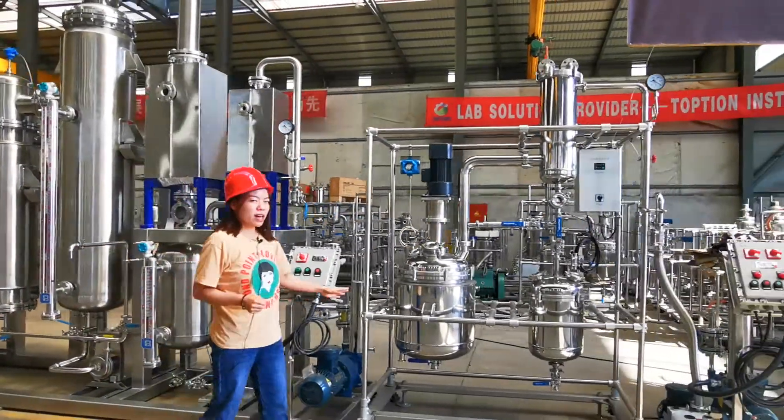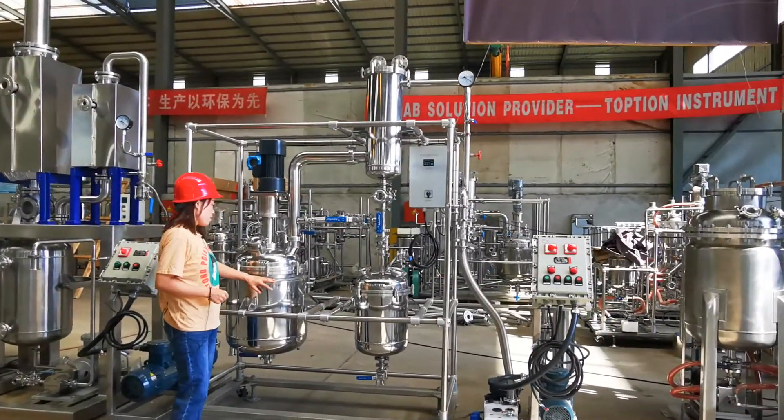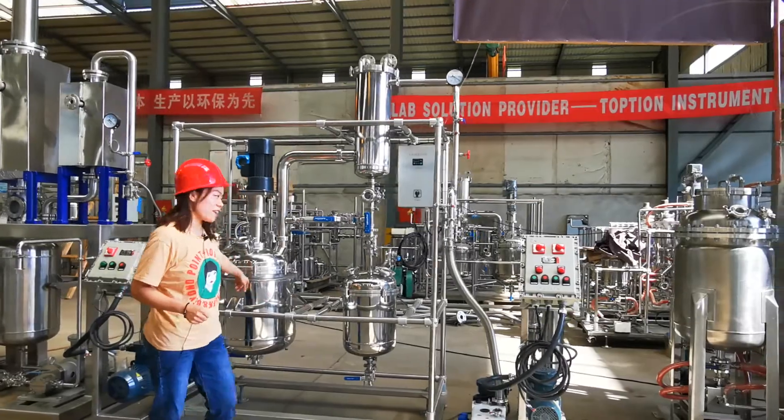This is our decarb reactor, also with a 40-millimeter insulation layer here.